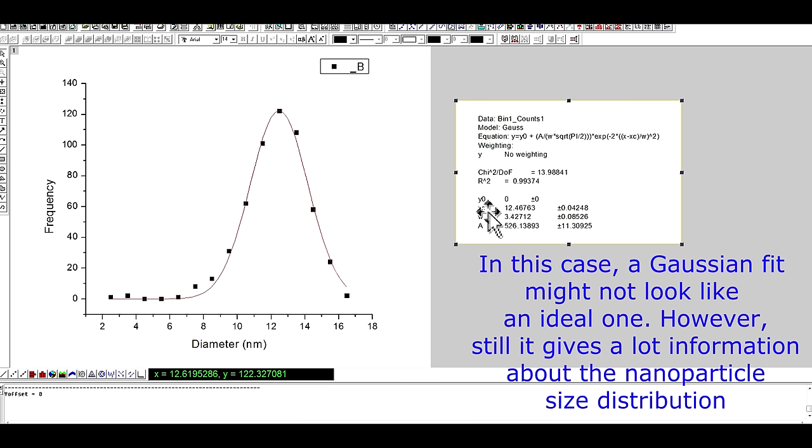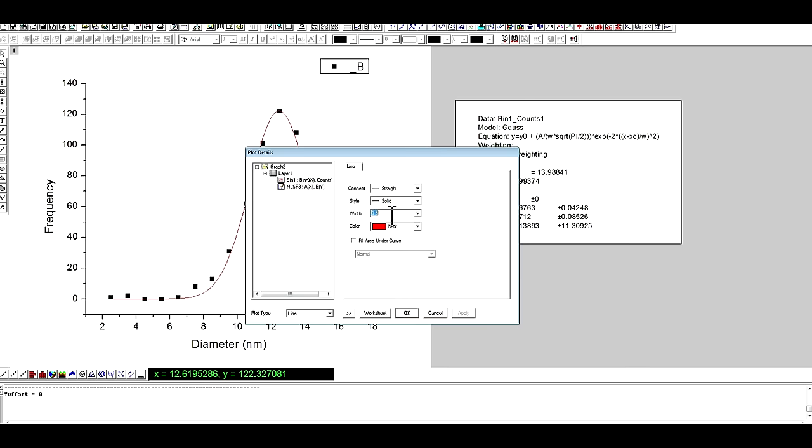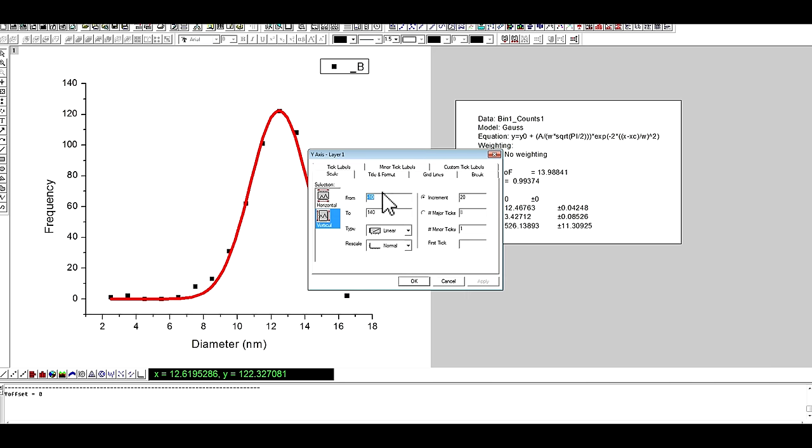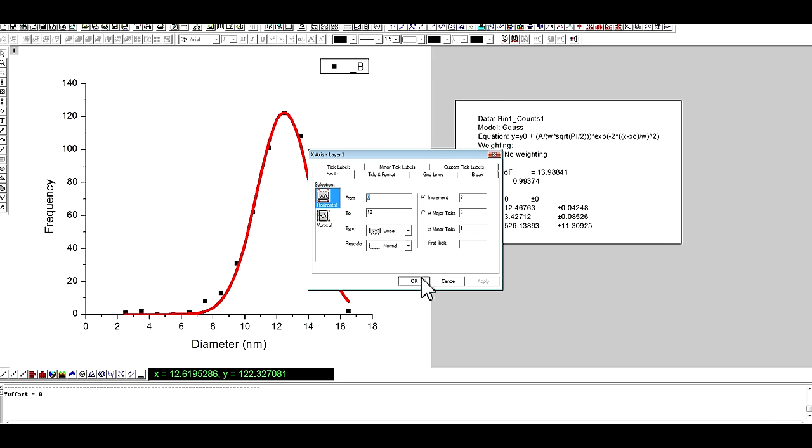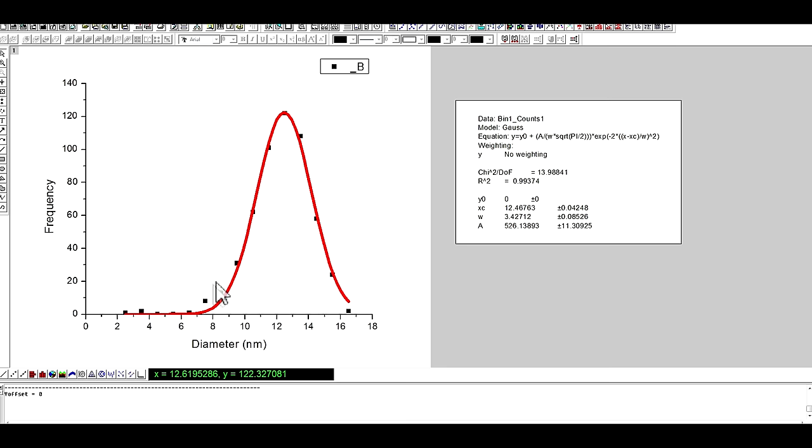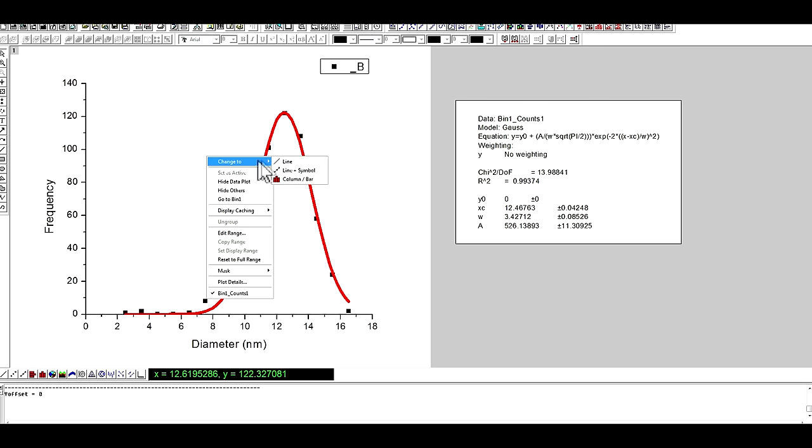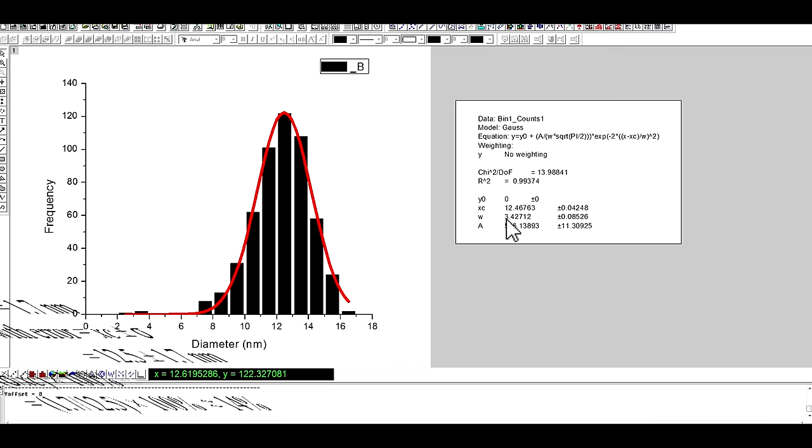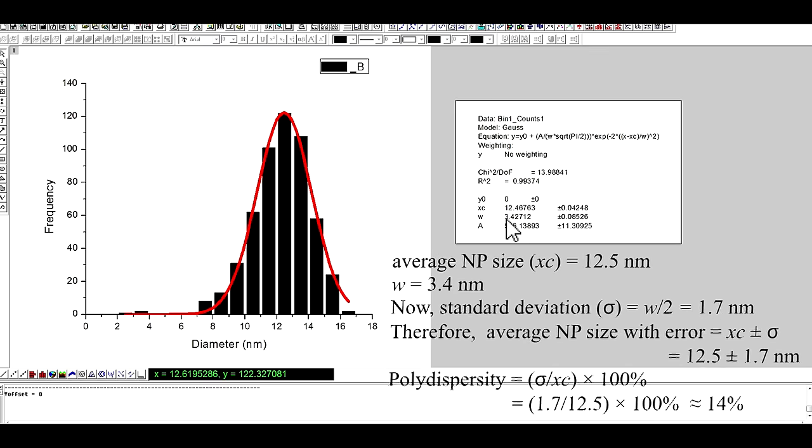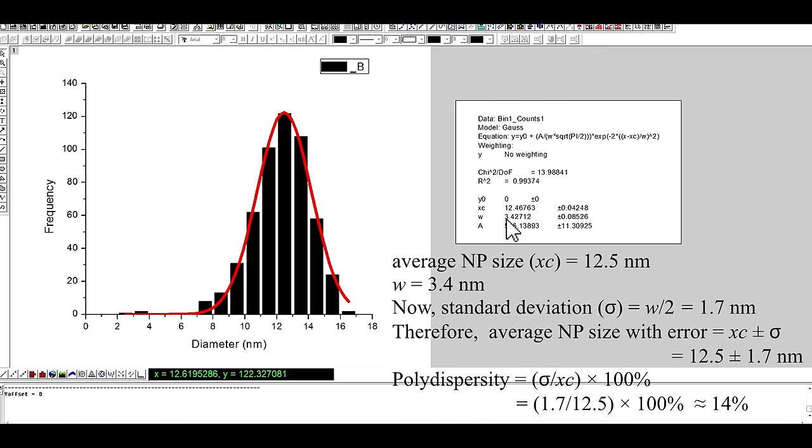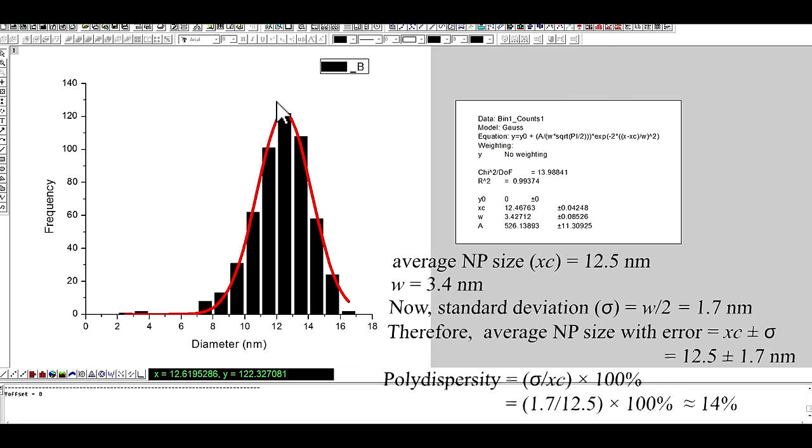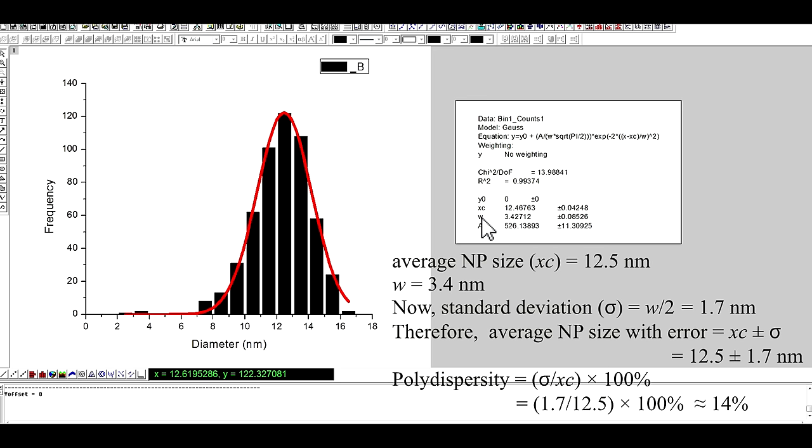And this xc is the mean particle size. And this w is standard deviation. So mean particle size is around 12.4 or 12.5 nanometer and standard deviation 1.7 nanometer.